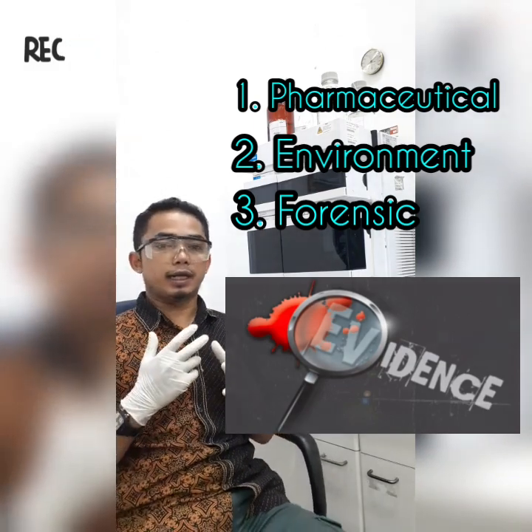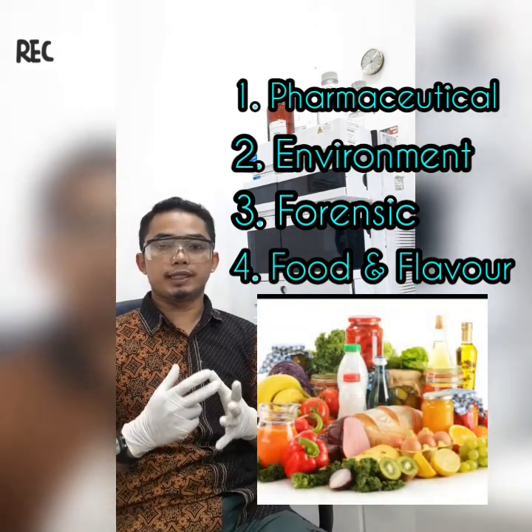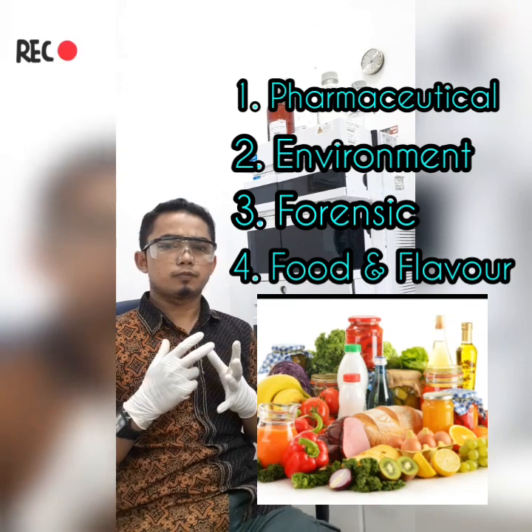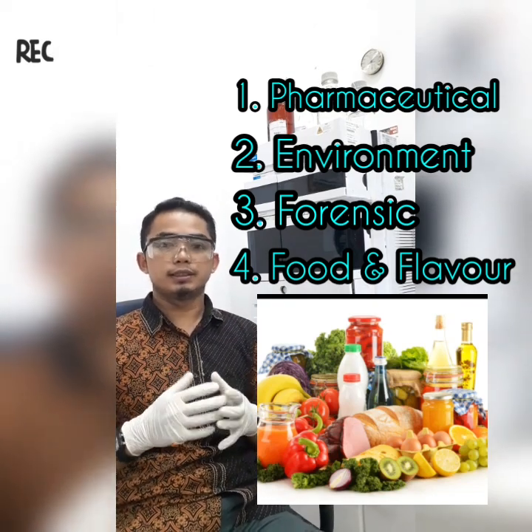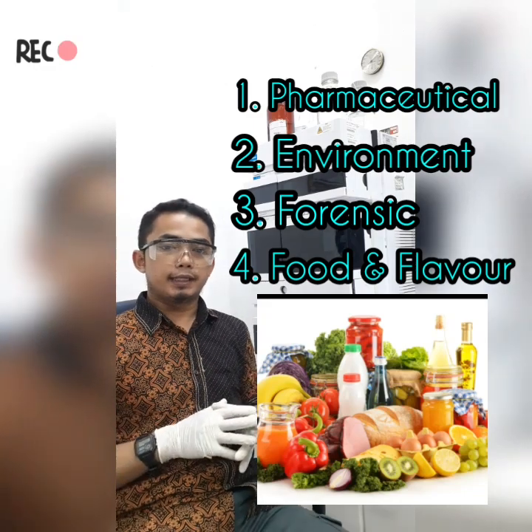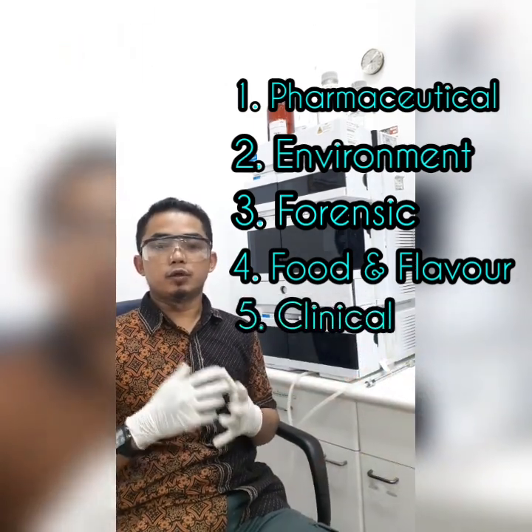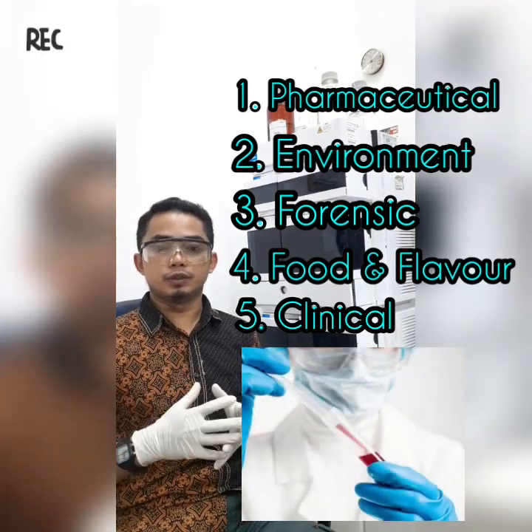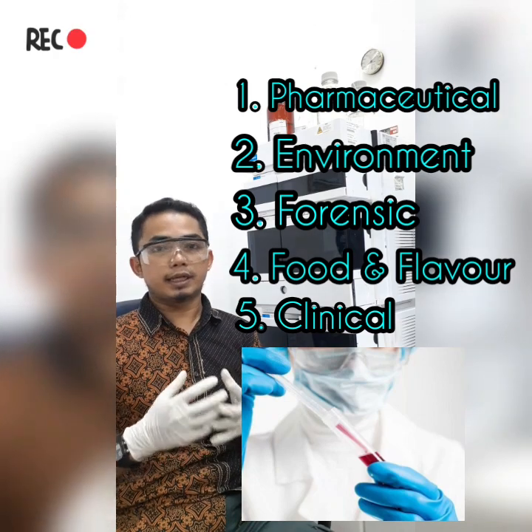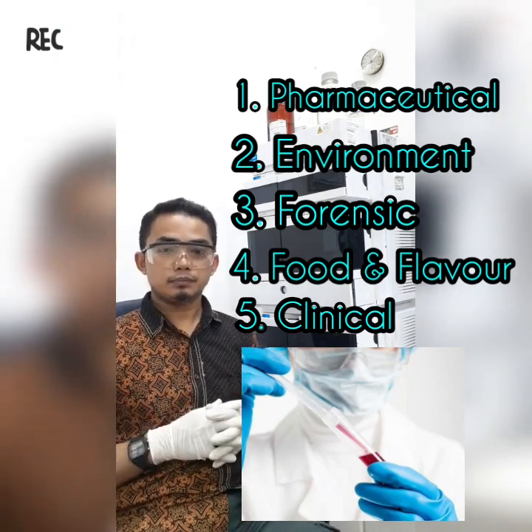And then for application in food and flavor: measurements of quality of soft drink and water, sugar analysis in fruit juice, analysis of polycyclic compound in vegetable, and preservative analysis. Application in clinical tests: urine analysis, antibiotics in blood. Antibiotics in blood can be analyzed with HPLC system.